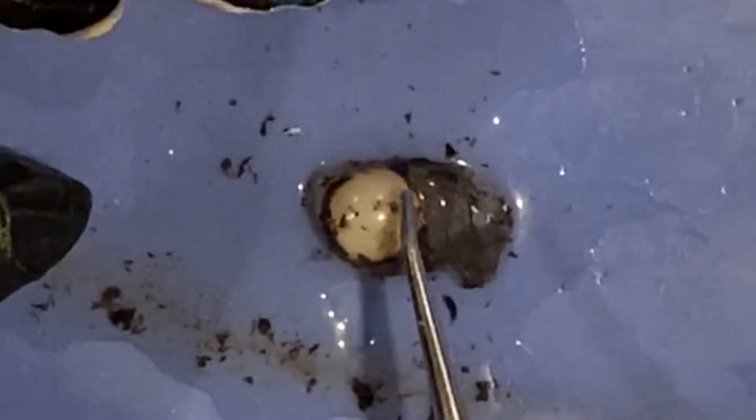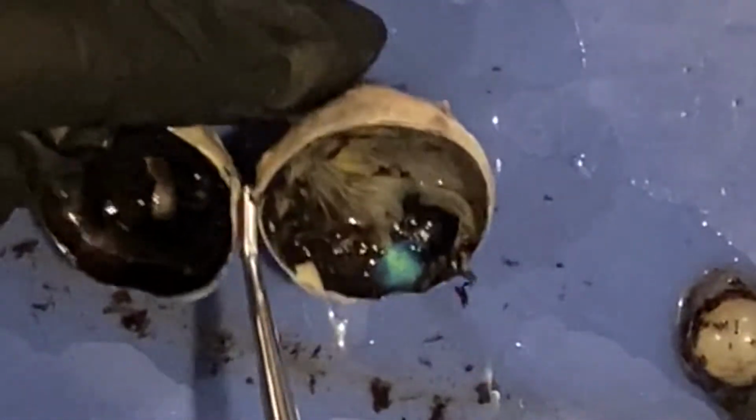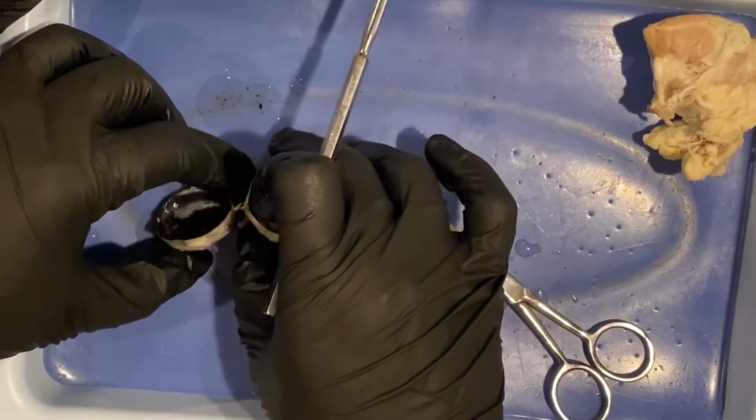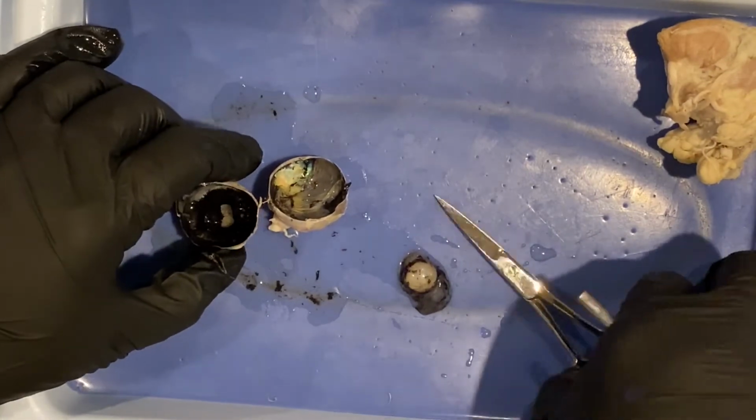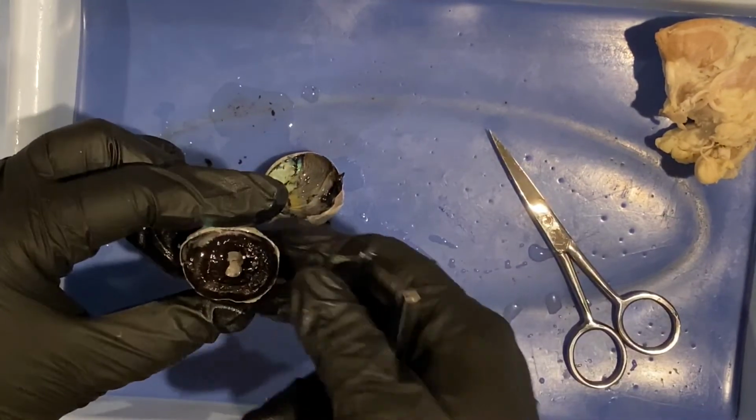And as you age, the flexibility of the lens gets worse, and it can lead to presbyopia. And I'm going to kind of move this guy to the side. When we look at both halves, actually, let's just focus on one of them. We still have a little bit connecting them. So let's focus on the anterior segment.